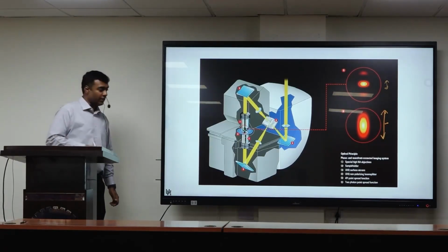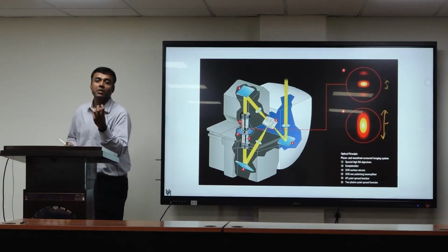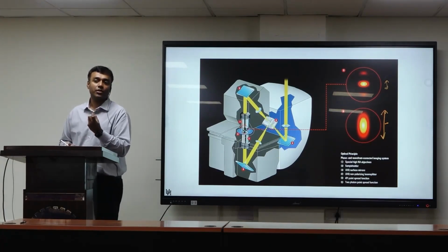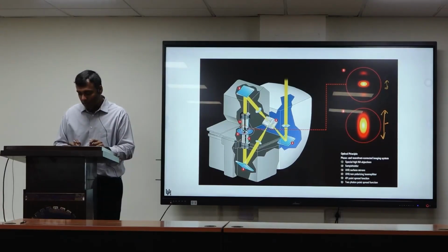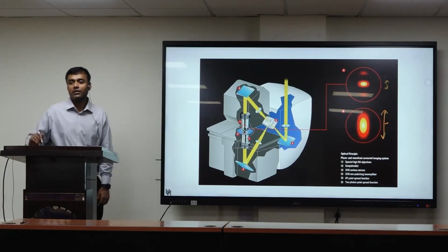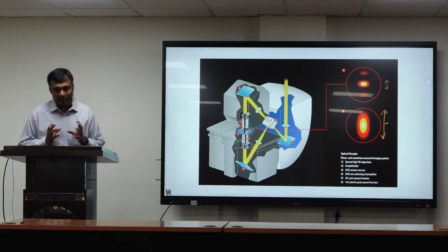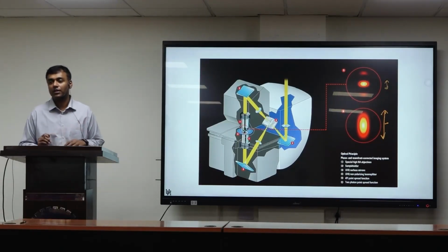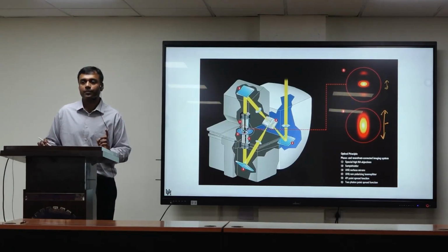If you can get measurements that give resolution better than the smallest spot, that is called super resolution. There are several techniques which allow us to do super resolution, which we'll get to in a few minutes. But this is almost the best we can do given the diffraction limit and some of these constraints. Any questions about this approach?